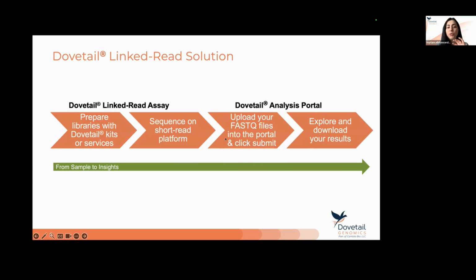So what I'm going to do is spend some time talking to you about the different linked read assays that we offer, and then the different analysis services that we offer on the portal. And then my colleague John will go in much more detail about the analyses, especially the differential analysis, which is the one that we're releasing tomorrow.